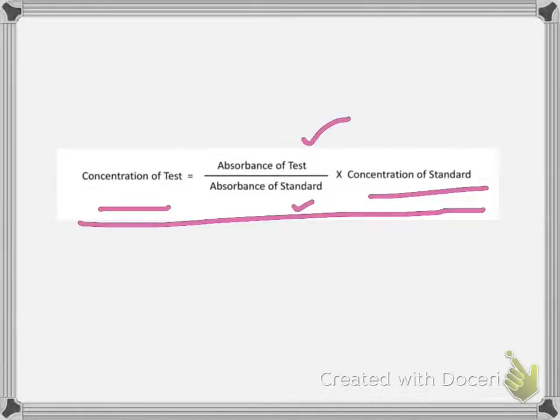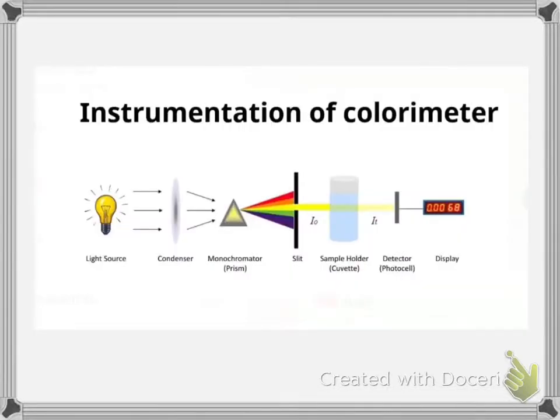Now coming to the instrumentation of colorimeter. The first component is the light source.